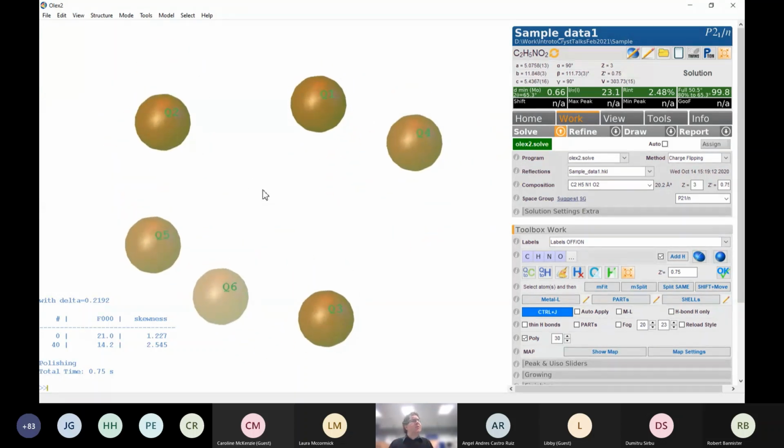Now, the one thing with a crystal structure is we only solve for the asymmetric unit. In a crystal structure, you have the unit cell, which is an imaginary block that is repeated by translations to generate the crystal. Inside the unit cell, an even smaller fragment is the asymmetric unit, and if you do symmetry operations, you will get your molecules to grow the unit cell, which you can then, just by translations, make the crystal you want. The program doesn't understand what you want for an asymmetric unit. It just goes to the smallest bit, but we as humans like things to be close together.